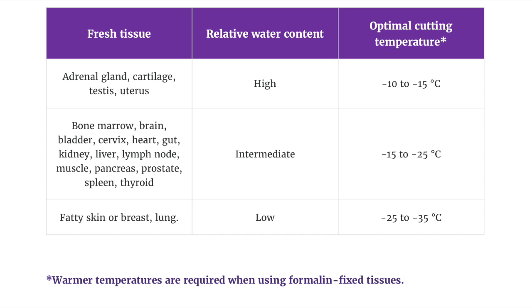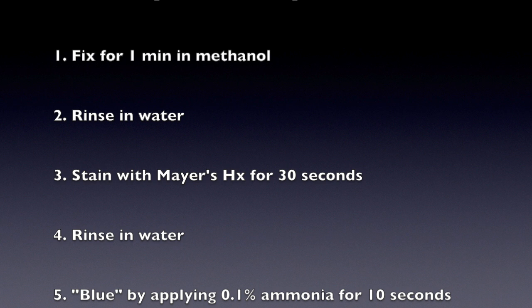Returning to our freshly cut sections, it's important that we proceed to fix them, such as with a brief treatment with methanol, followed by our desired staining protocol, which in this case is a rapid H&E staining procedure.